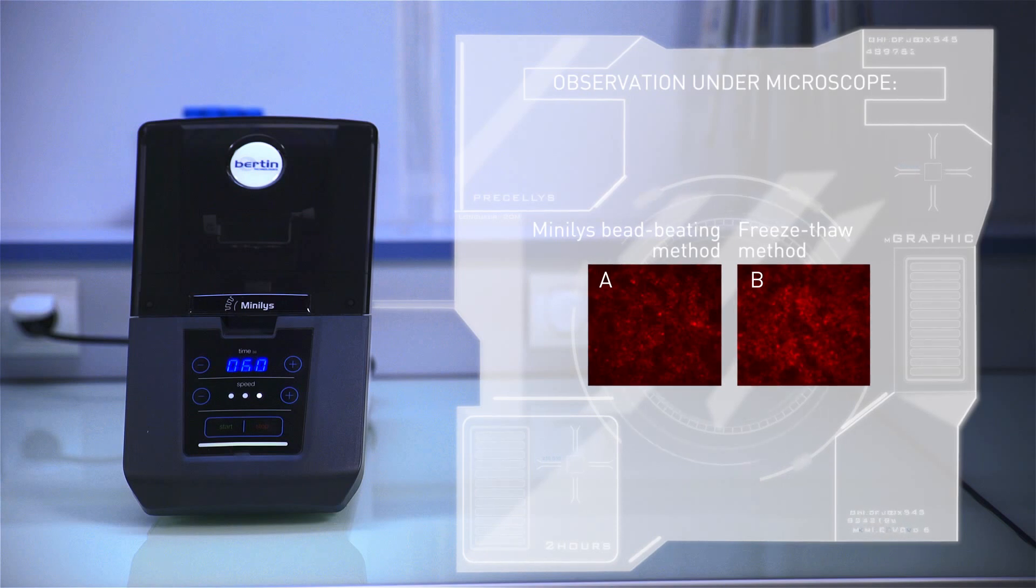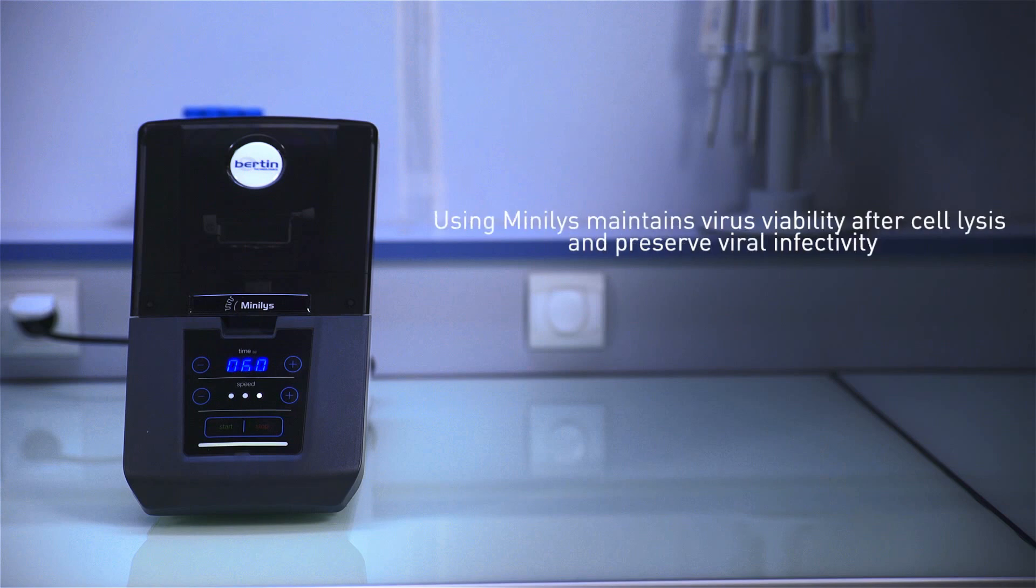The viral vector facility discovered that the Minilis offers an efficient way to release rAAV vectors without impairing viral infectivity and transduction efficiency. It's a better alternative to the previous method since it saves a significant amount of sample preparation time.